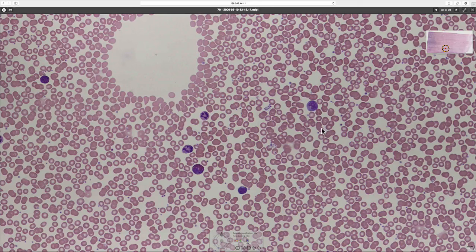In summary, the blood film contains mostly red blood cells with a small number of white blood cells, which are split into two groups: those with granules — neutrophils, eosinophils, and basophils — and those with no granules — lymphocytes and monocytes — as well as platelets.